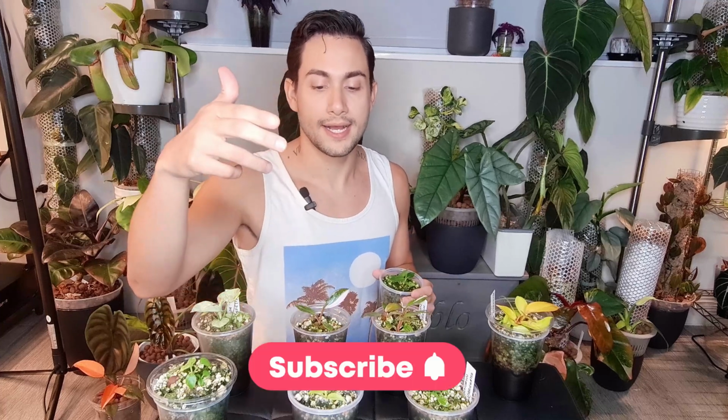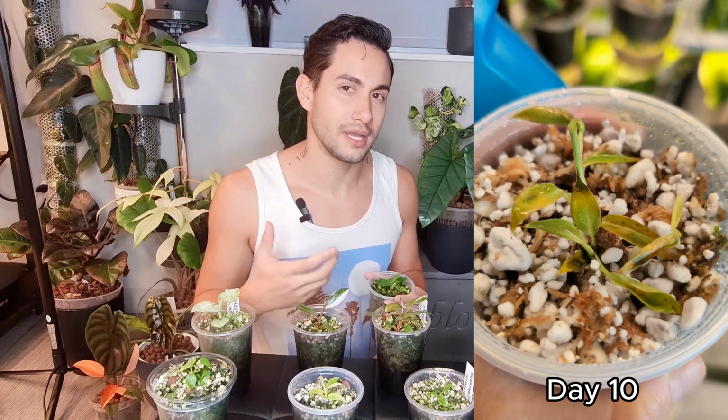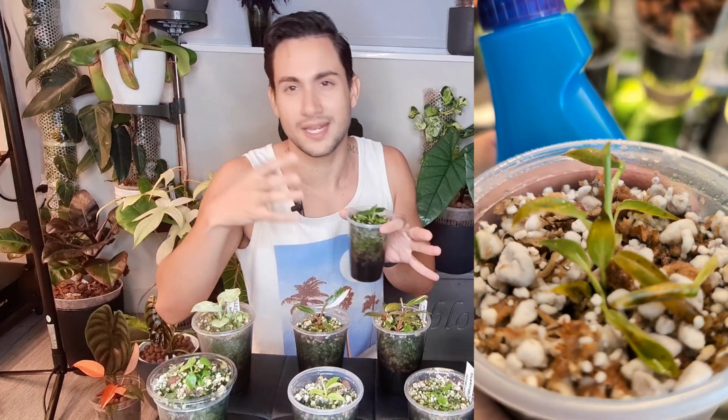This plant actually was growing inside the container really well. It was having no issues. Again, I think I left it in there way too long, waiting for the Whipple Way to get contaminated more with the mold that it came with. So I think it just stayed in the container too long. It was already pushing against the sides. It was getting too big for it.